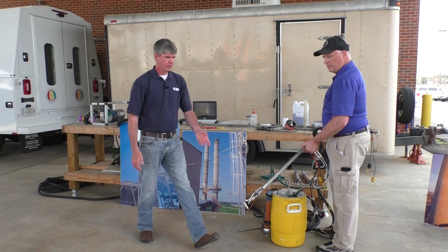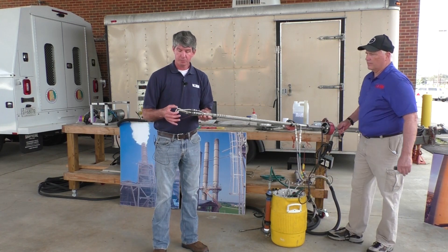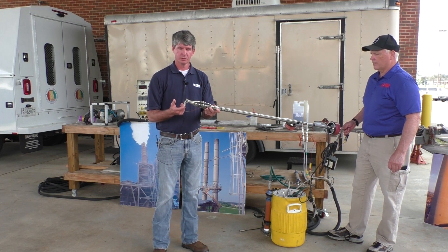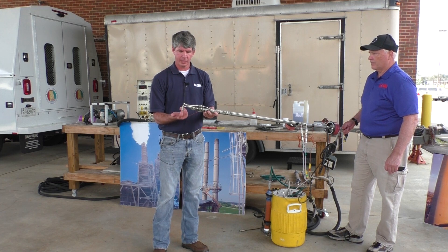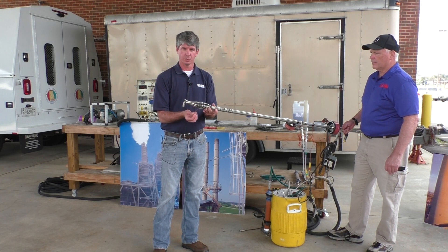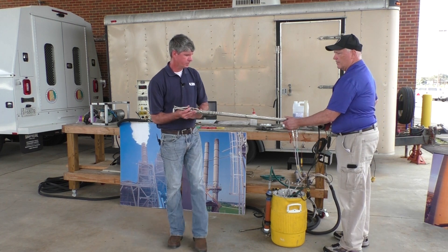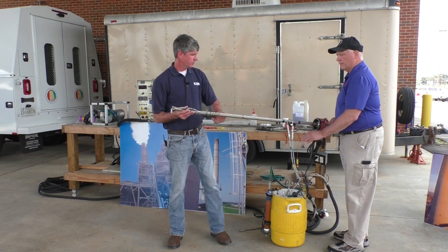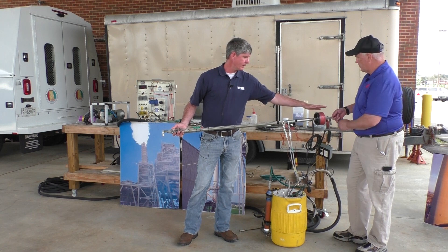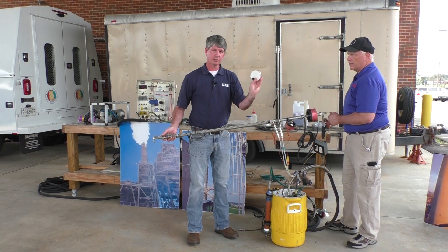This equipment first consists of a probe, which has pitot tubes on it, which measures the flow. Then we have a nozzle, which is where the sample actually goes in. Then we have a thermocouple, which is where we read temperature. Our sample comes in the nozzle, goes through the probe. This is our filter holder, where the actual filter is housed, and that's what collects the particulate.